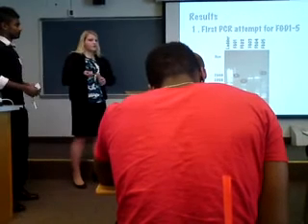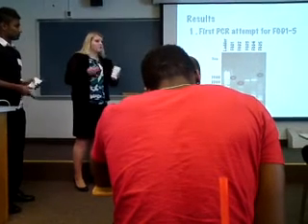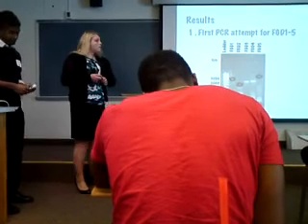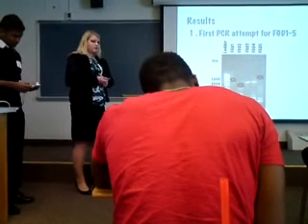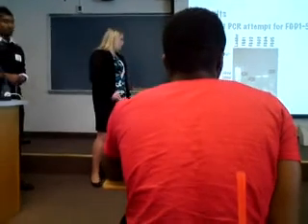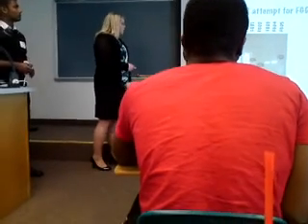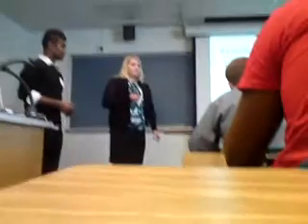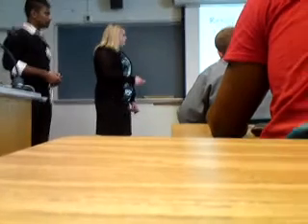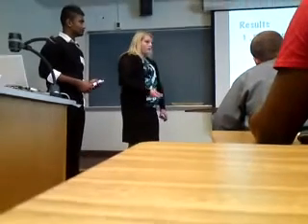After this PCR amplification, we're hoping to have a lot of copies of our certain DNA sequences. So in this case, we'll run an agarose gel to make sure that we were actually able to amplify the sequences we were hoping to amplify. This picture here shows our gel attempt for that. Here on the left side, we have our ladder. This indicates different lengths of base pairs, so we can use it as a marker to see the sequences we were hoping for.